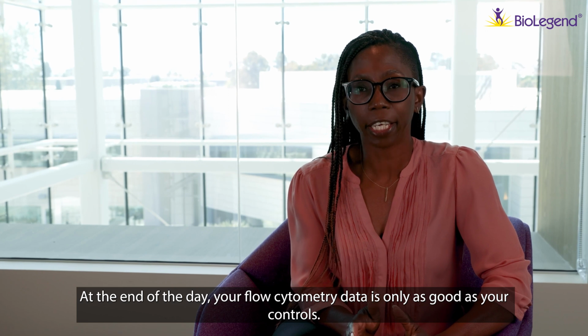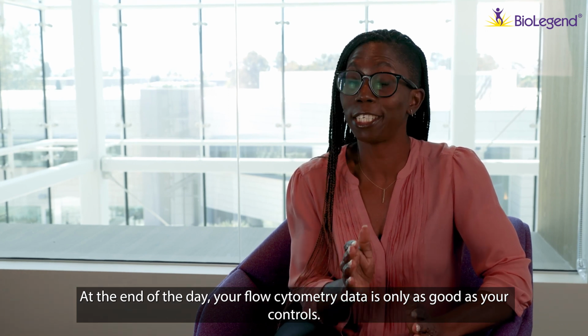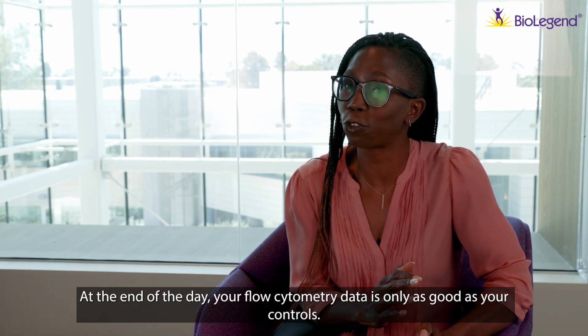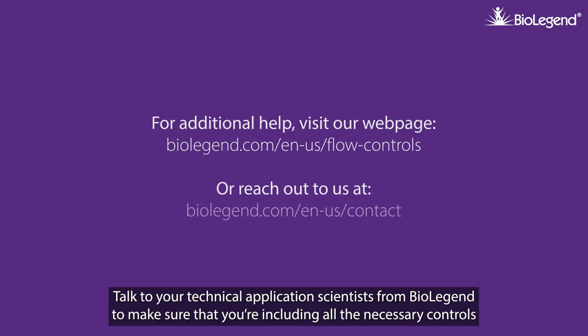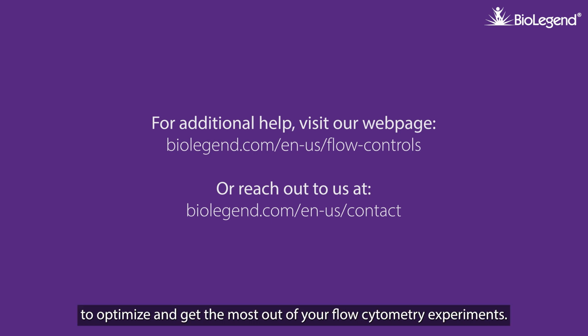At the end of the day, your flow cytometry data is only as good as your controls. So talk to your flow core manager, talk to your technical application scientist from BioLegend to make sure that you're including all the necessary controls to optimize and get the most out of your flow cytometry experiment.